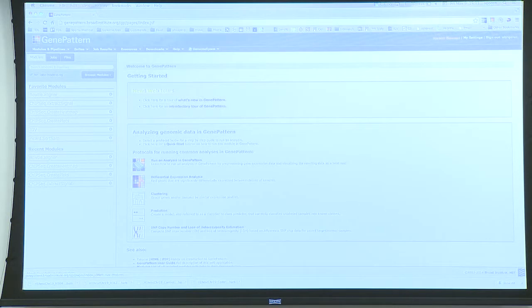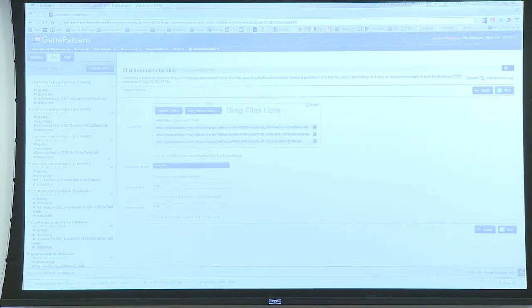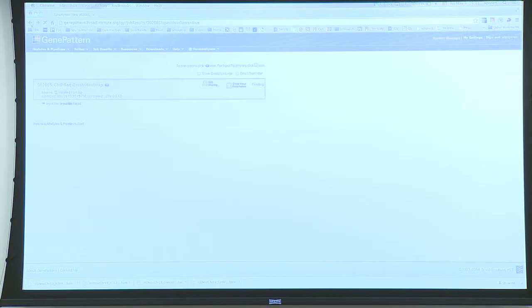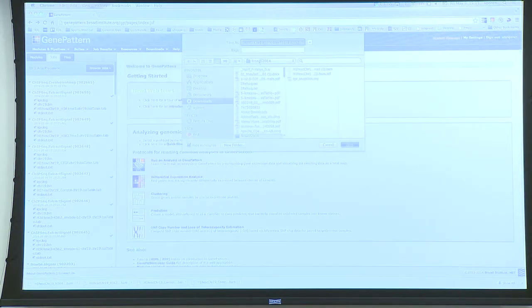I go back here. Okay, modules, and we say we want to create heat map. I take jobs, and I don't do batch, but I select all the tab files. So we should have 6 of them. Okay, and then I just click on run. It should be running. And I also wanted to download the tab files so we can look at them.